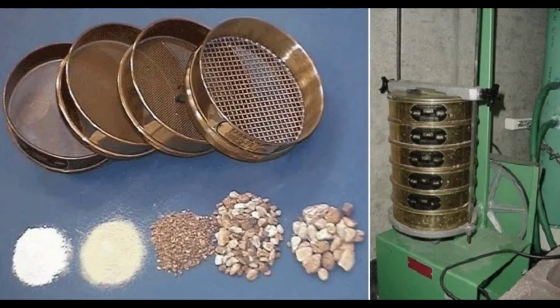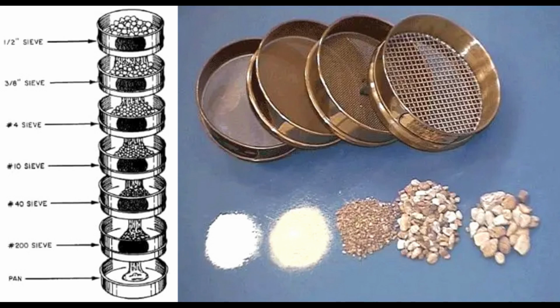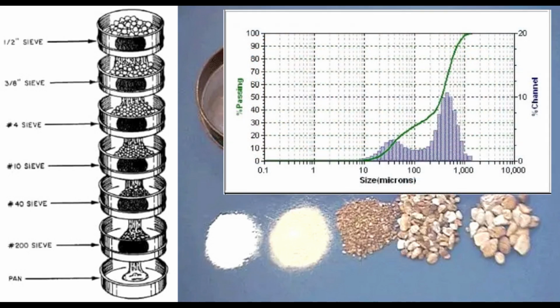Particle size distribution or grain size distribution, as we discovered from previous videos as well, is the method to analyze your sample, your sediment. You create this grain size distribution curve to examine the average size of particular grains in this sample. We usually calculate it by weight and then figure out what percentage of the total sample it is, and you can create the curve. So you can say that particle size distribution is the curve or the graph which represents the average particle size of your sample. We're looking at the smallest particle detected to the largest in your sample, and you can see main features of it.